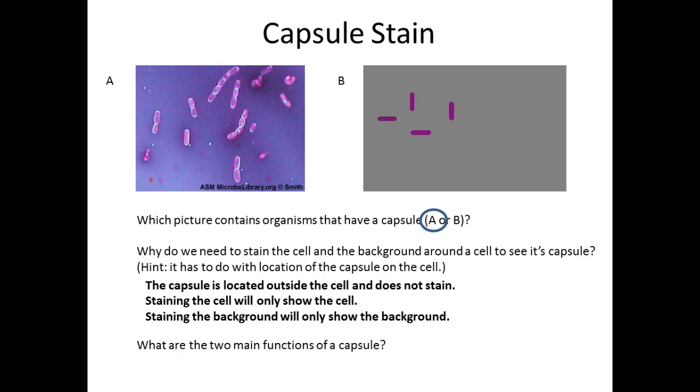What are the two functions of the capsule? Protection from phagocytosis, from being destroyed by the white blood cells in our body, and adherence, being able to attach to surfaces like our body.